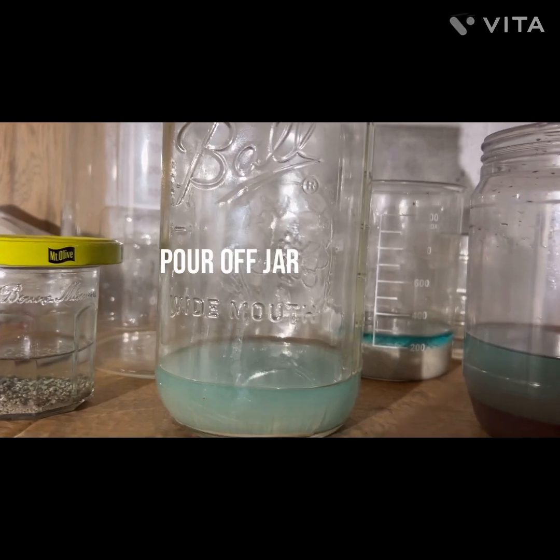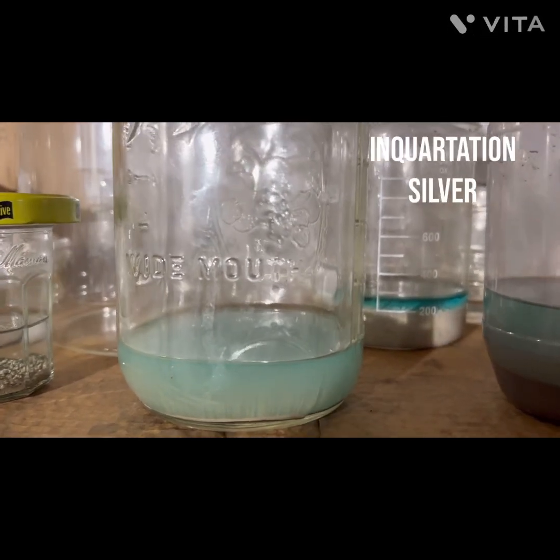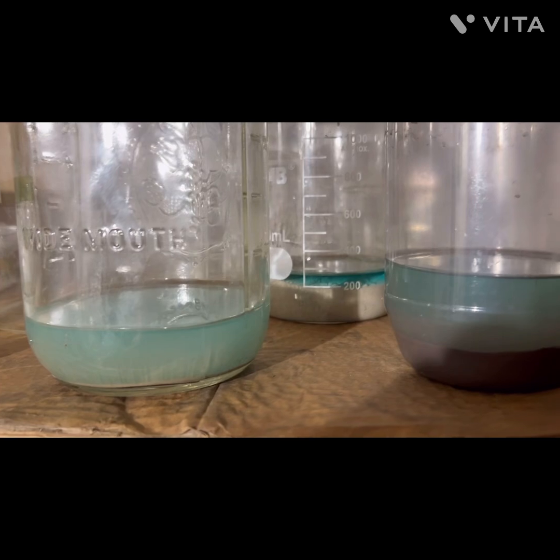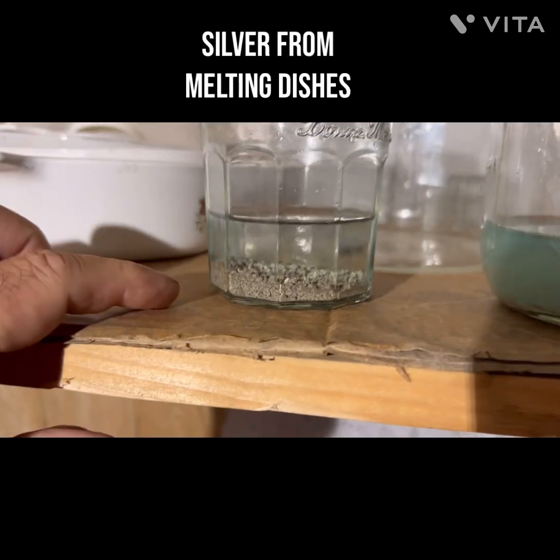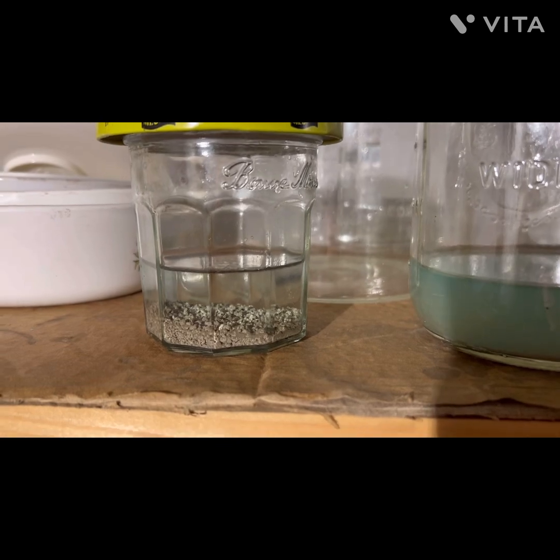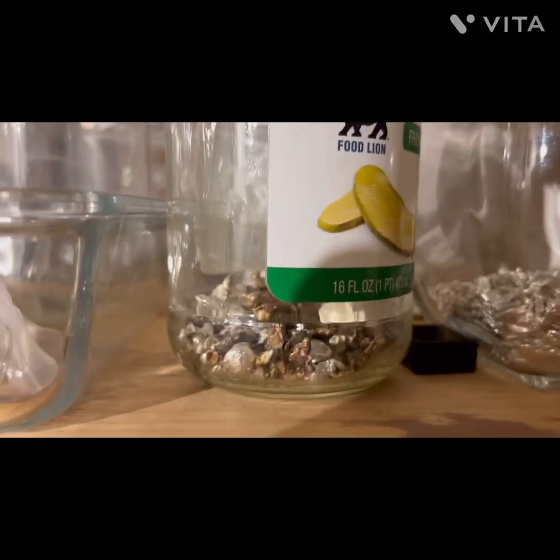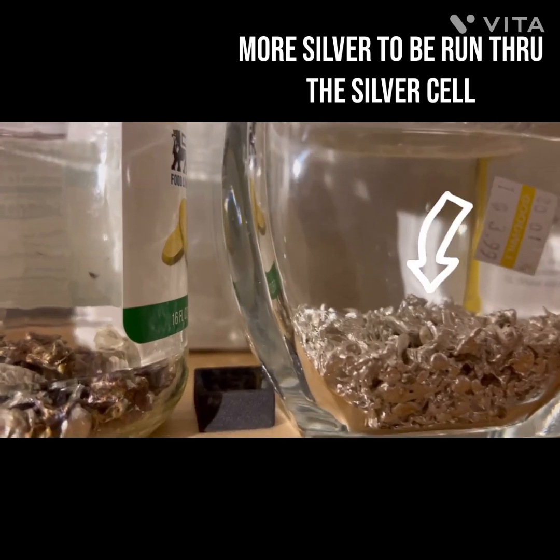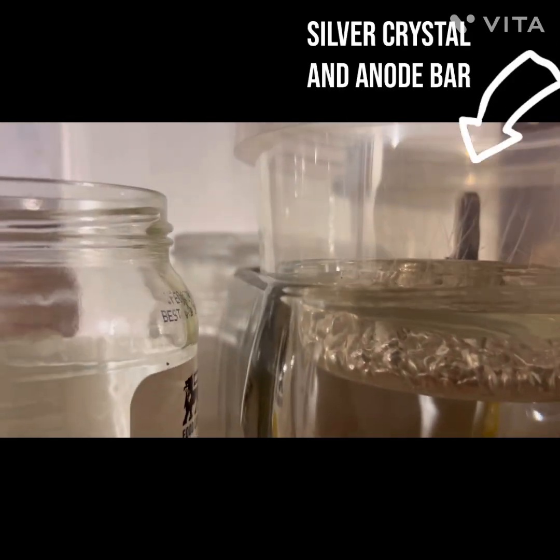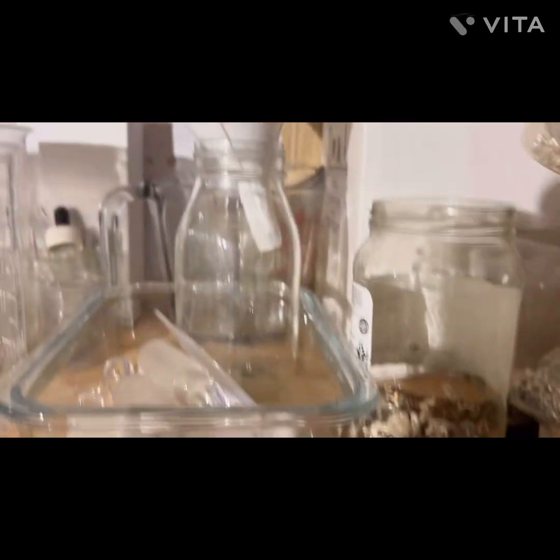Alright, so what we have here are some of the silver projects that have been cooking along slowly. This one right here is from the cupellation silver, this one was from the copper cell where I managed to eat some more out, and this was the silver I recovered from cleaning up the crucibles — it turned out pretty nice, it's got a little bit of copper in it. We're going to put it in here — I call that dirty silver, that's been cleaned up pretty well. That's from the silver chloride, and that's the little bit left over from my silver cell on top. So there you go, that's the lab.